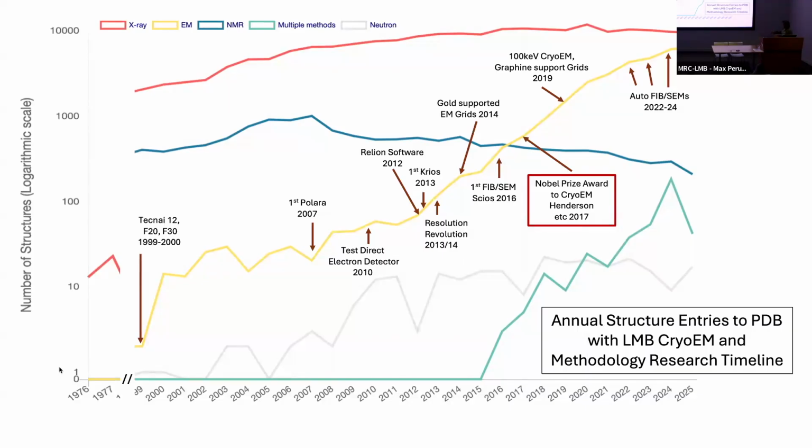And here, in 2013, we moved into the new LMB building, very nice. And then we bought three more microscopes. This is our first Krios 300 automatic cryo-EM. At that time, it was 4 million, not much. Now you can have the Krios G4, already 6 million pounds.